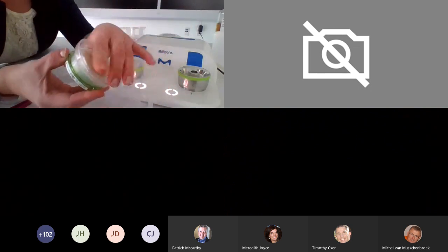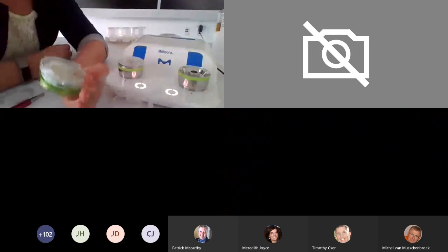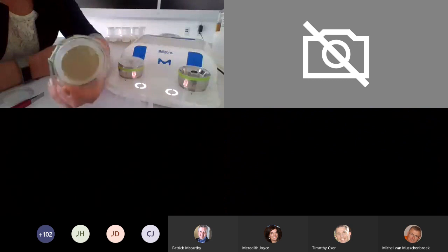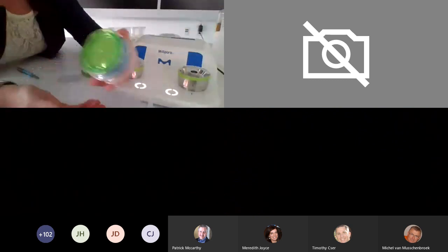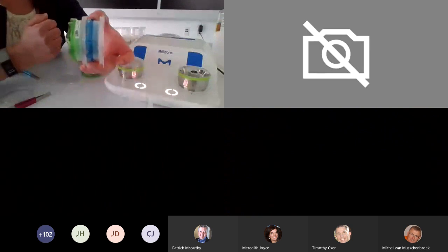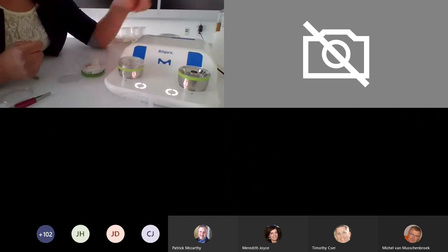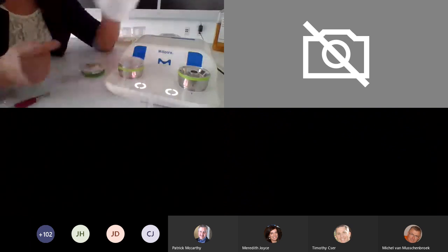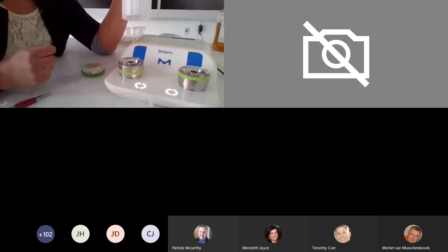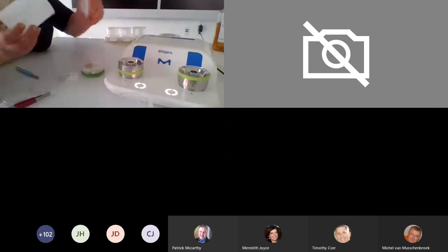You saw how I had to push down pretty significantly to snap this membrane off. Now, I'm pressing this on because I want that convex shape to come in full contact with the media. I simply squeeze this a little bit and it pops right off. Another nice thing about the hinge lid — you can see I just did that with one hand. It goes right on top of that media cassette. That is my filtered unit, my membrane filter, on top of my media cassette. I can stack these media cassettes if I'm doing multiple samples. Now I've got this filter base left behind — there's a handy little tool for that. I don't need to touch this; I can disinfect this, push it on here, pop it right off, and that removes my filtration base.